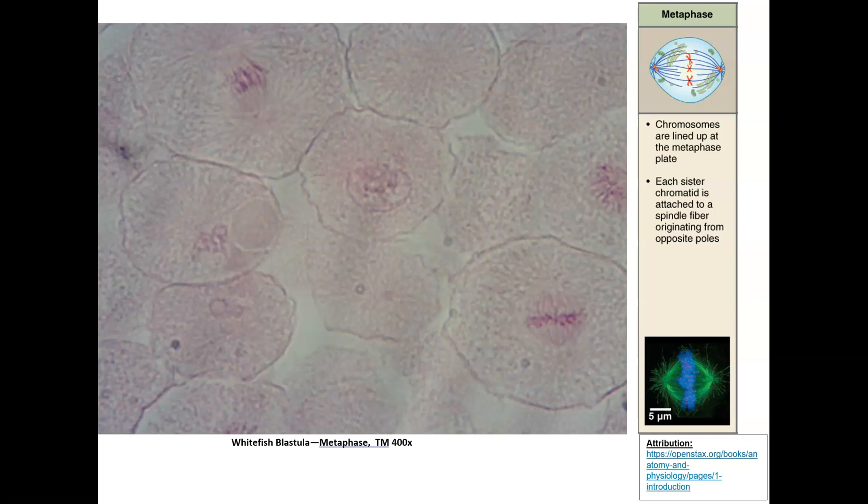Did you figure out what the metaphase cells were? There are two — one here and one here. You can see spindle fibers, which is one of the big keys, and you can see the chromosomes lined up at the equator. Those are two big clues to help you identify a metaphase cell.